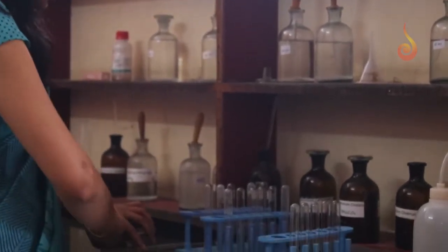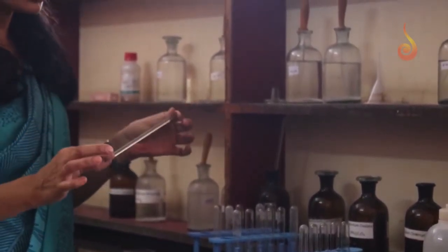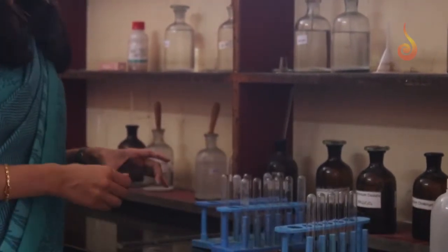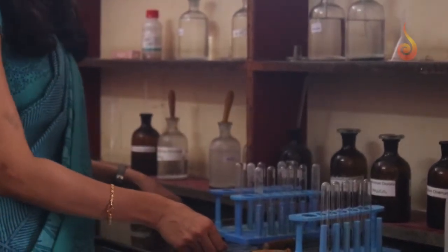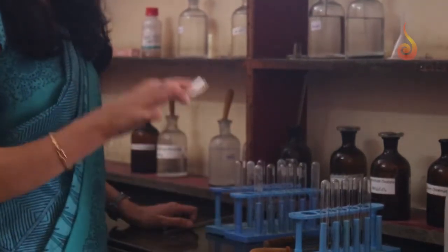Then next, to use reagents, we use glass droppers. Then apart from that, we also use a glass rod. Why do we use a glass rod? To perform the flame test or the glass rod test. And then the next one is the watch glass. Why do we use a watch glass? Because to prepare a paste for the flame test, we will be using a watch glass.